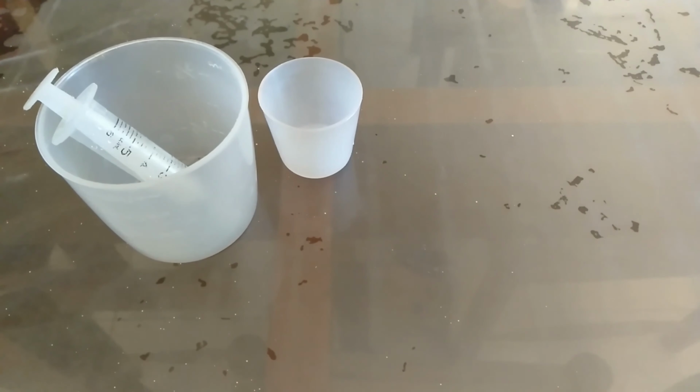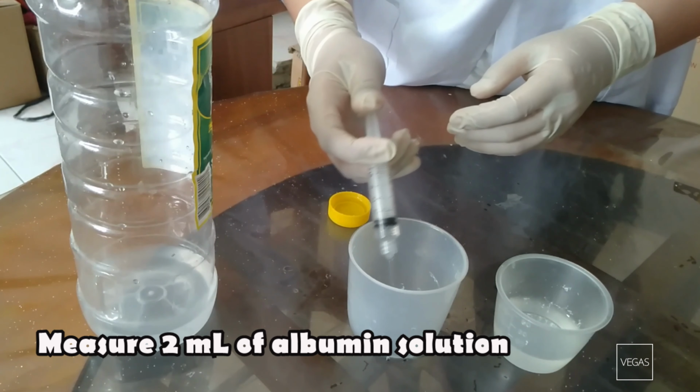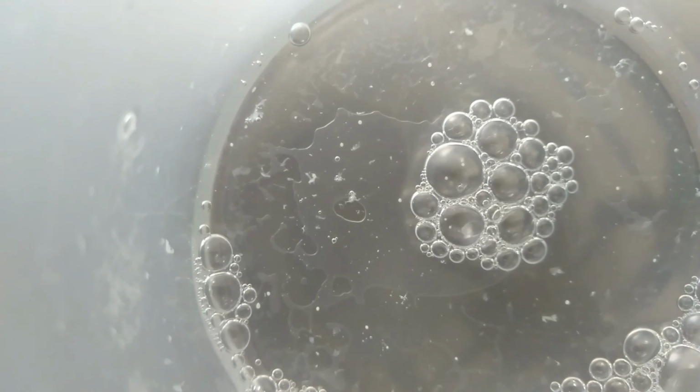The last experiment involves acid. We'll be using medicine cups, syringe, vinegar, albumin solution, and fork. Measure 2 ml of albumin solution and put it in a container. Add in 5 ml of vinegar. Mix thoroughly and leave for 5 minutes.